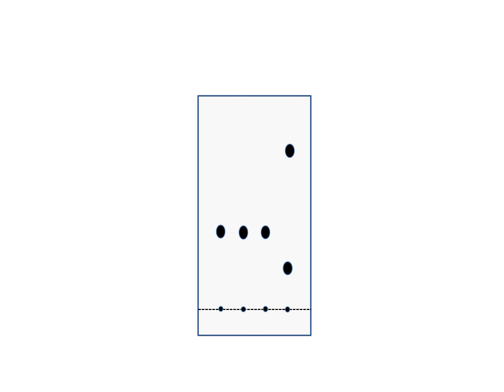And finally, at the end of the experiment, your thin layer chromatography plate should look like this. That's all for this experiment.